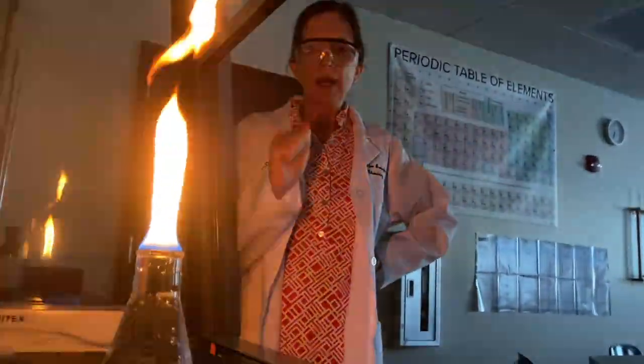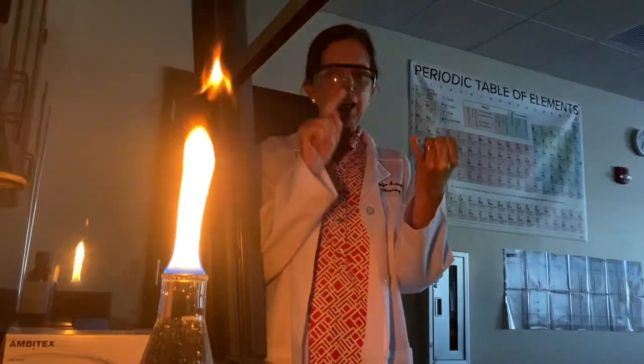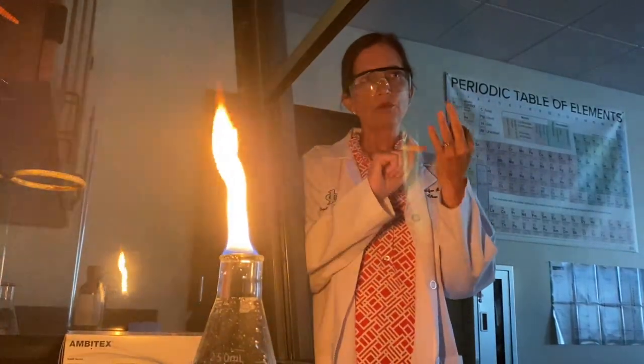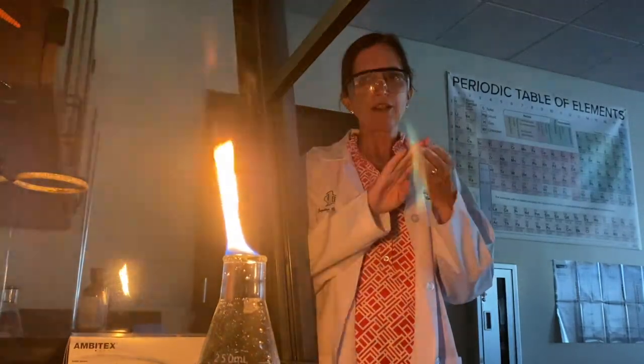You're going to look up the MSDS sheets for each one. You're going to specifically look at the flammability, the specific gravity, and the solubility in water. And you're going to tell me which of those three things it is based off those three characteristics. And there's a way to solve it using those three characteristics, and you can spot on get the correct answer.